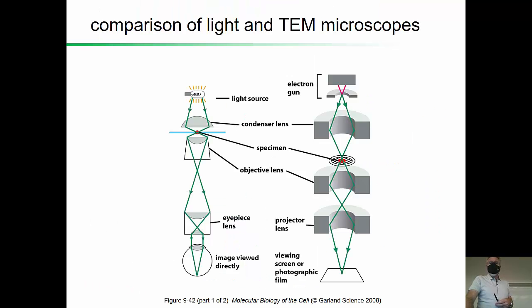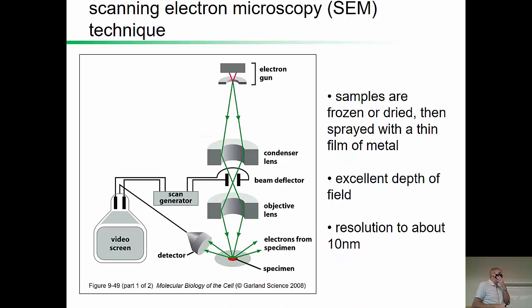I should also point out that transmission electron microscopy has a low depth of field. So you can see you need to actually use a very narrow sample, and you can only visualize a very narrow sample. Whereas scanning electron microscopy has a big depth of field. So in the example we looked at, the photographer or the microscopist had put a whole Drosophila fly into the system.